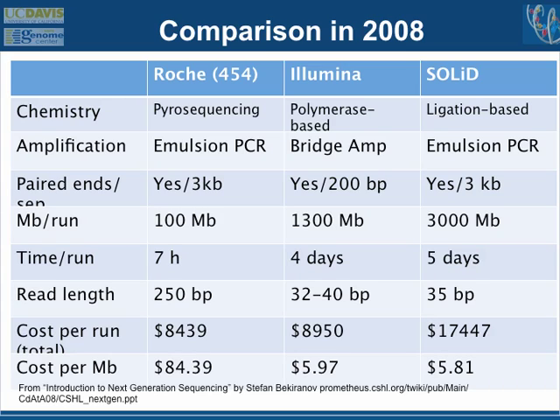And so there were 5,000 papers using Illumina sequencing to do a variety of things, with all the tricks needed to make libraries and to do the informatics and to feed it. And there were correspondingly 50 papers with ABI Solid. So it may be equivalent in many ways, but it just lost out in essence in a race.